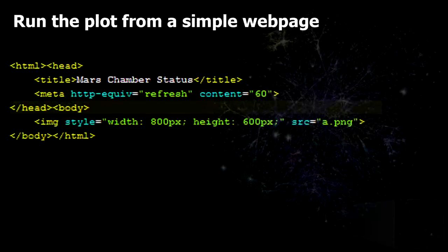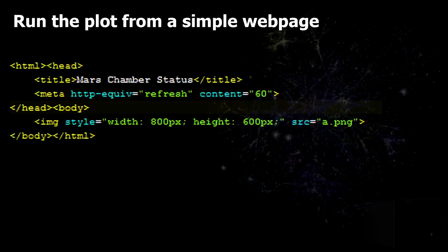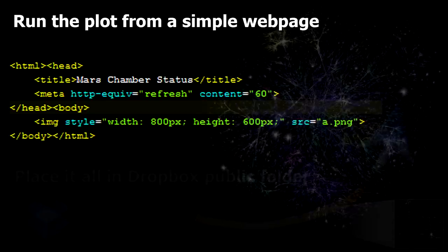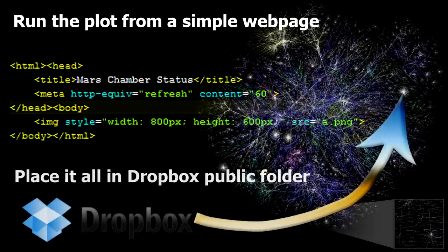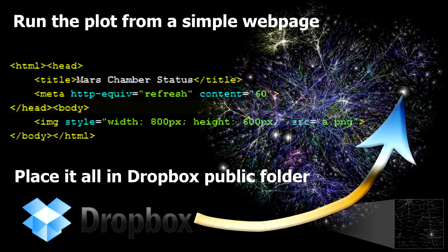So now here is an example of probably the lamest web page in the world. Its only function is to show the picture and refresh every 60 seconds. But it works. Now since the Niels Bohr Institute has a crazy IT security, you cannot run a web server from within the firewall. But what you can do is you can place all this code in your public folder in Dropbox. And then you have a web page you can view from wherever you are in the world.